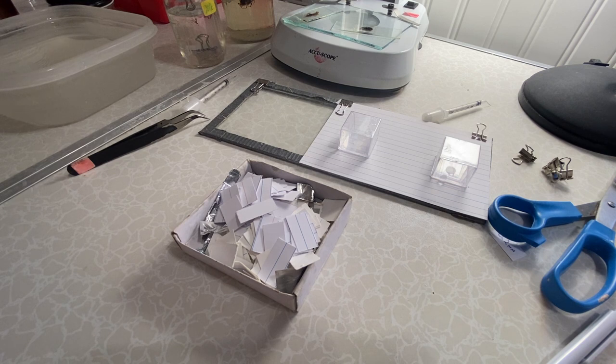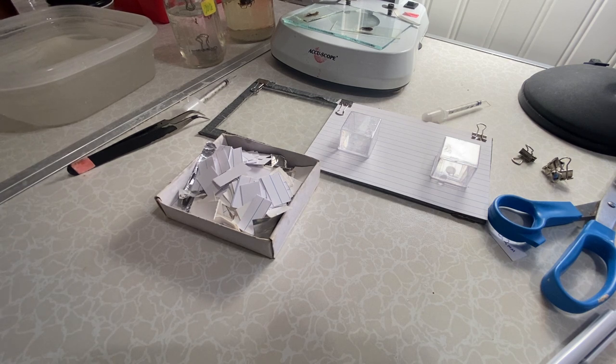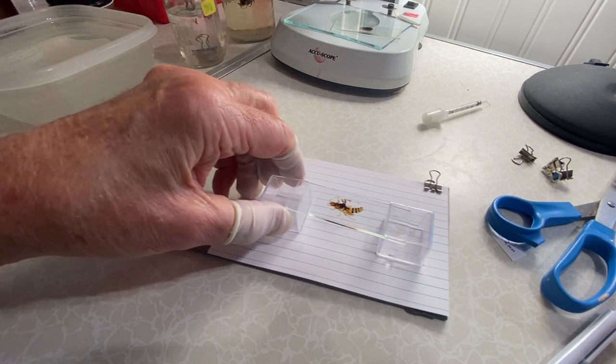Once you have reached 100% alcohol, the next step is to transfer the microscope slide into xylene, and this is where it gets a little tricky because of the toxic nature of xylene. If anybody is going to use xylene — it's an excellent clearing agent — it has to be handled properly. I always do it outside where ventilation is adequate, and I use an activated charcoal filter face mask.